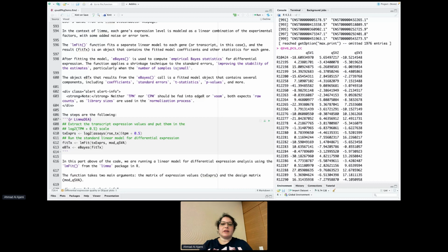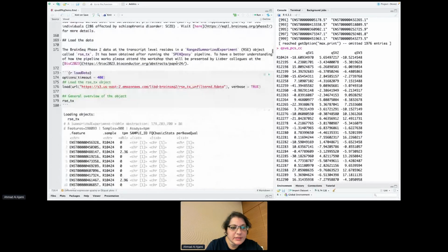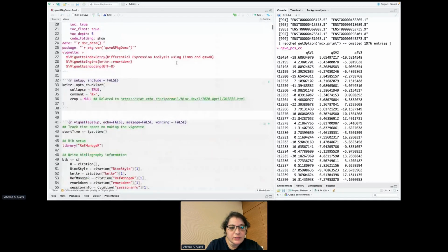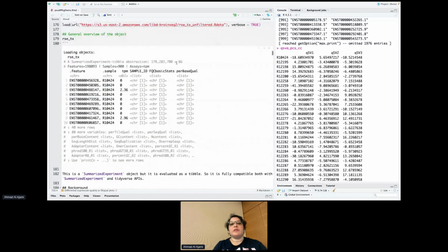In this demo, we have 900 samples, but you can try a smaller sample size and see if it runs well.